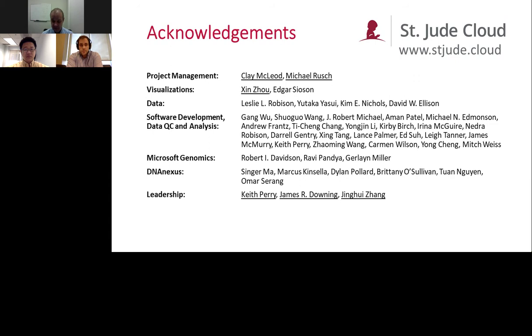So I've said that we have our St. Jude tools that are available through St. Jude Cloud. But what I didn't say is that there are a whole load of other tools available through the DNA Nexus platform to do many, many things that we haven't had time to implement. Some of the new variant callers, for example, are available through DNA Nexus, and you can run them directly on St. Jude Cloud data. So hopefully that answers your question.